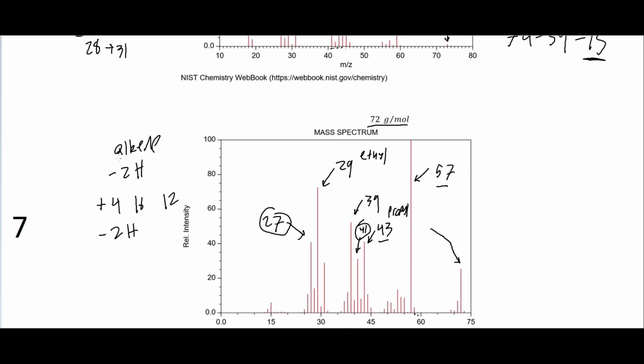And so what we see is that if we take all these things together, the double bond there, the oxygen, then the minus 2 hydrogens, what we get are groups that look just like alkyl groups, and so those would actually have the same mass on their fragments. And so what we might have is something that has an alcohol going off to other things, and we might also have a double bond somewhere on here, so probably something at least that looks like this.